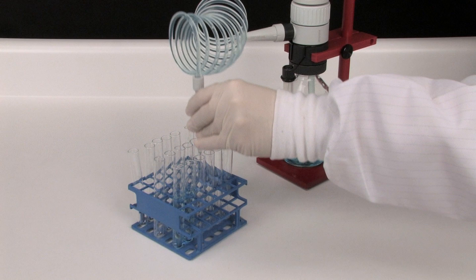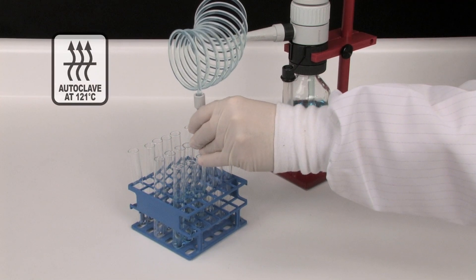No tools are needed for assembly, removal for cleaning, or if required, autoclaving.